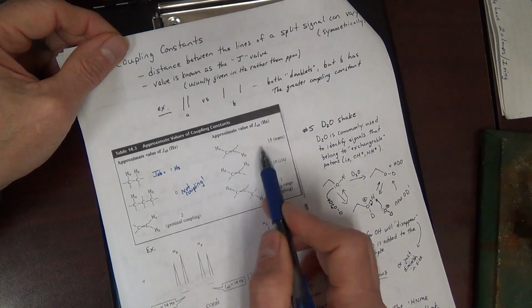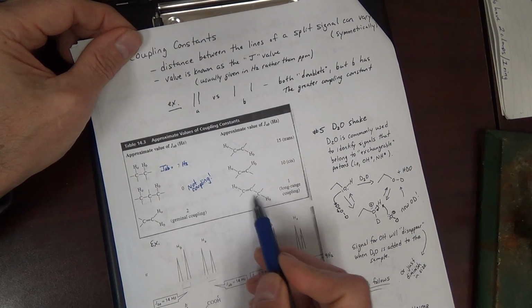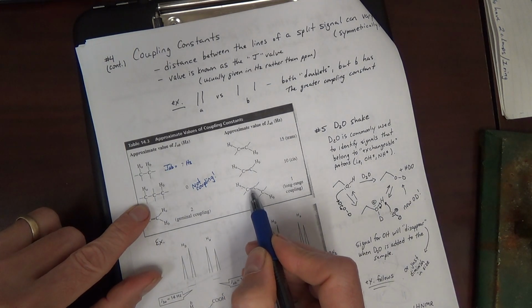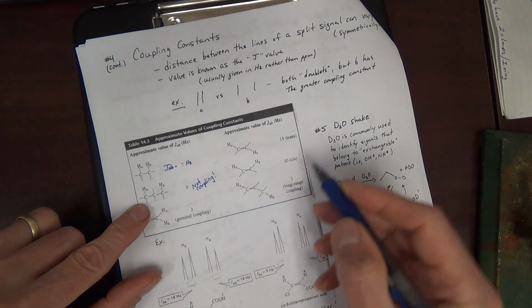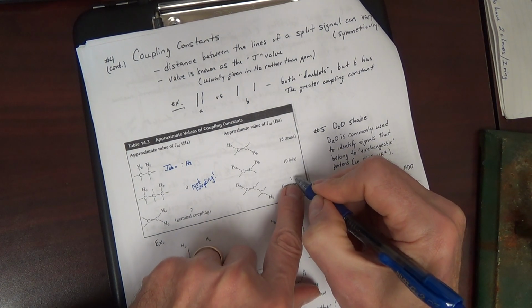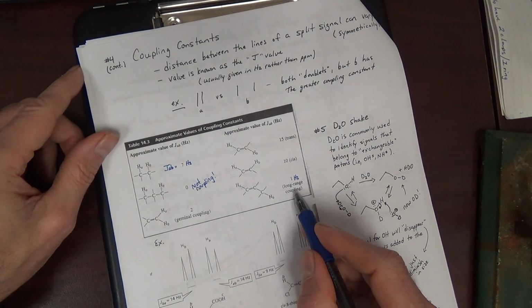We'll look at these here. But first, let's look. This is an example of long-range coupling. 1, 2, 3, 4 sigma bonds away from each other, like this. But because there's a pi bond in here, it does sort of promote the coupling of these. But look, the coupling is very small. Considered a small coupling. 1 Hertz. Okay? So that is an example of a longer range coupling beyond 3 sigma bonds.